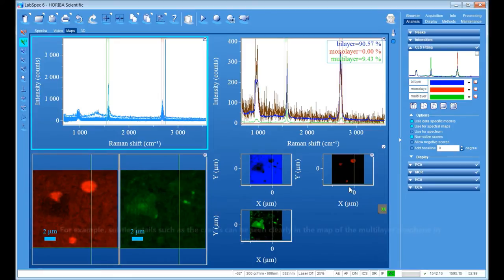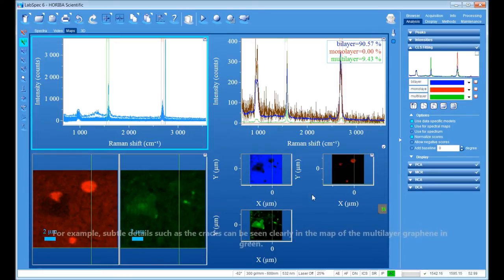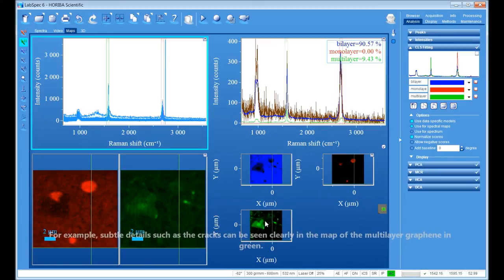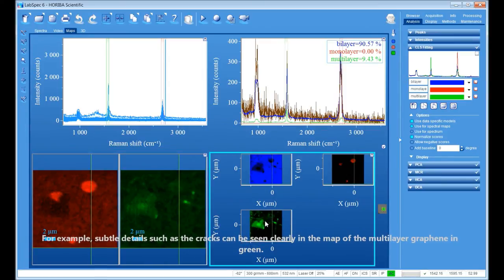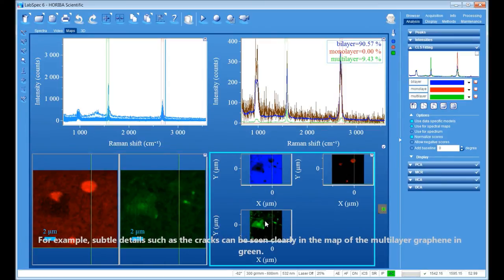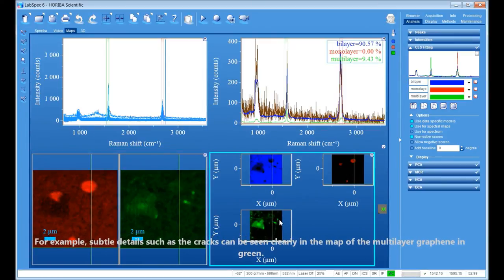For example, subtle details such as the cracks can be seen clearly in the map of the multilayer graphene in green.